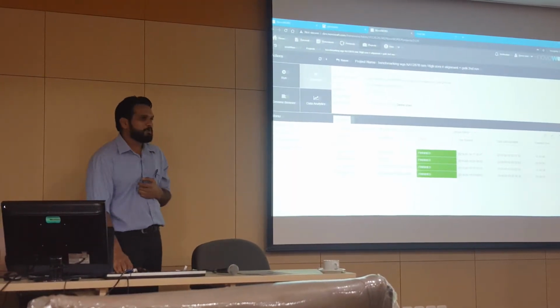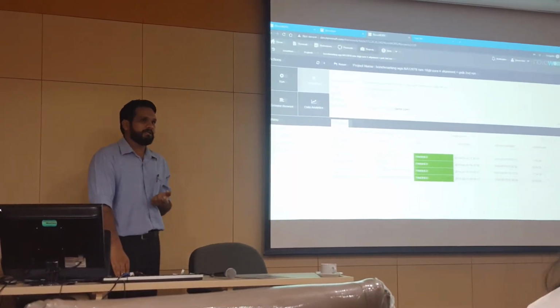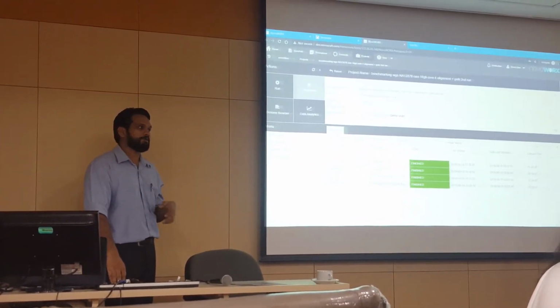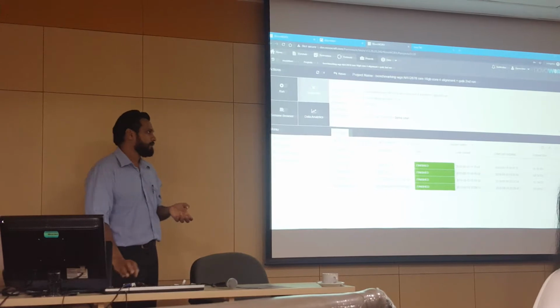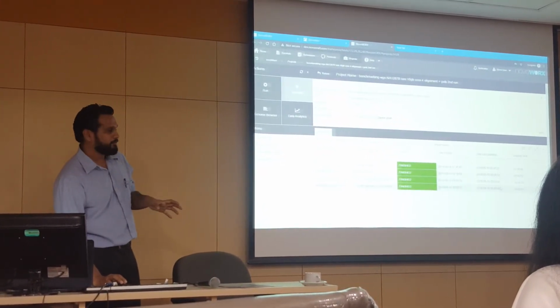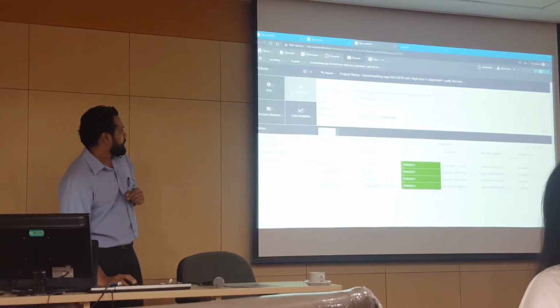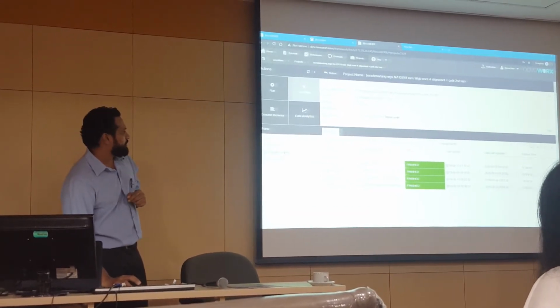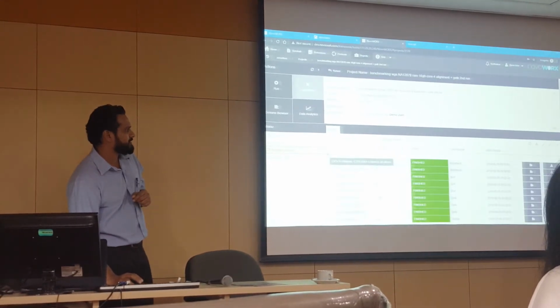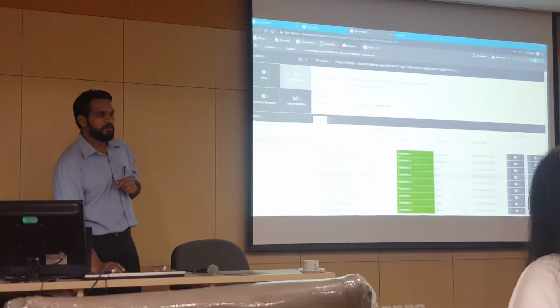So when you open your project view, you'll get a full list of the modules that have run and their status, also the timing for each of the modules. So the time elapsed, the date started, all of this information is always here. When you go to your projects and click on the pipeline outputs, you will get a full list of the files that are produced by this project.